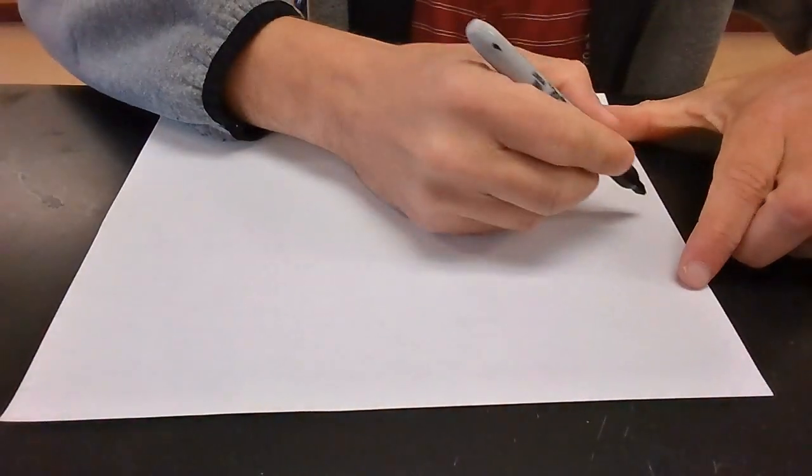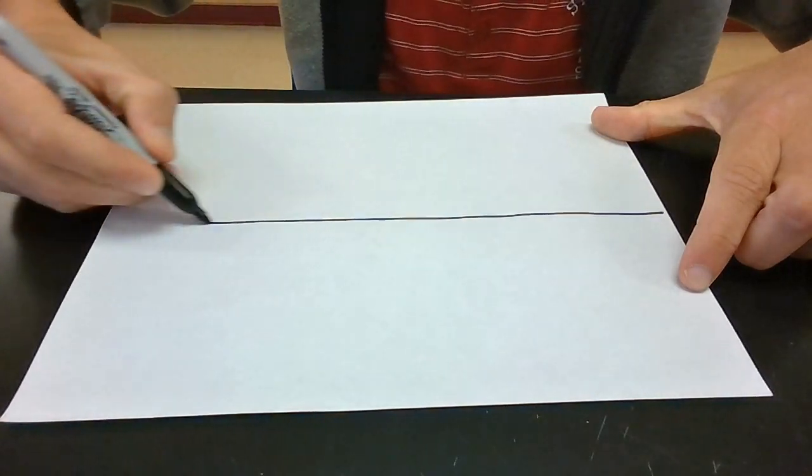For number 2, it says, using a periodic table, determine the chemical symbol for each of the 8 elements to be tested. Write the chemical symbol for each element next to its name in the data table. So the lab wants us to make a little data table and put the names of the 8 different elements we're going to look at on there. So what I'm going to do is divide this into 8 sections.